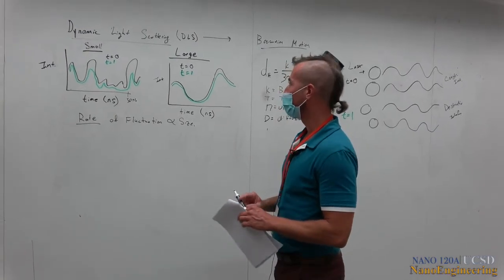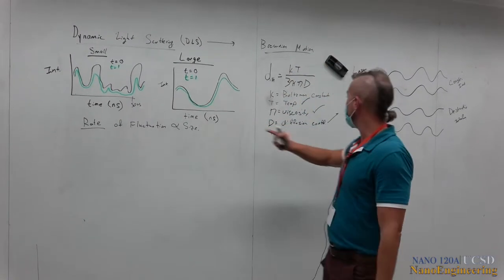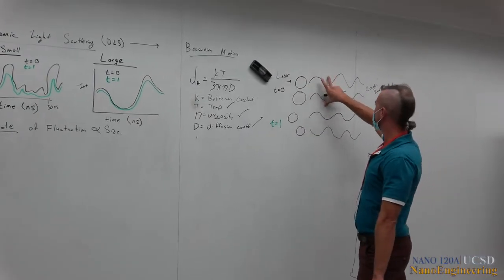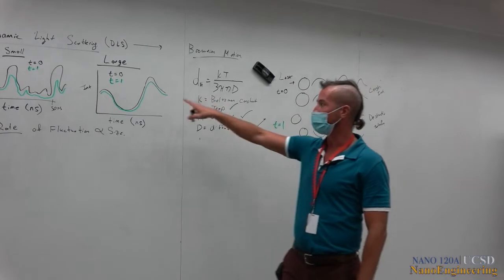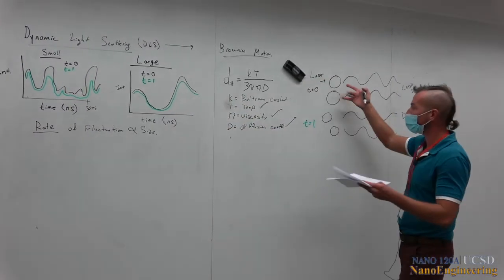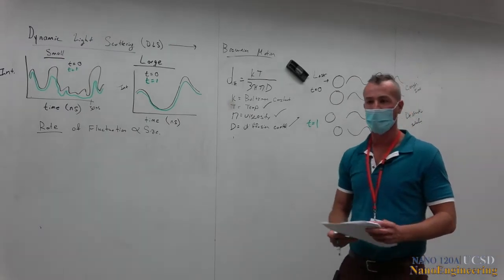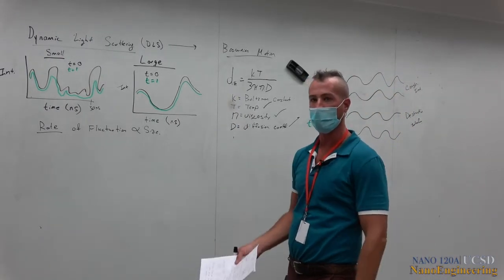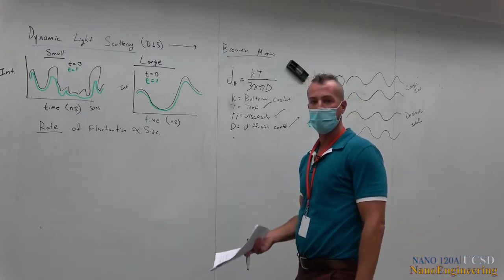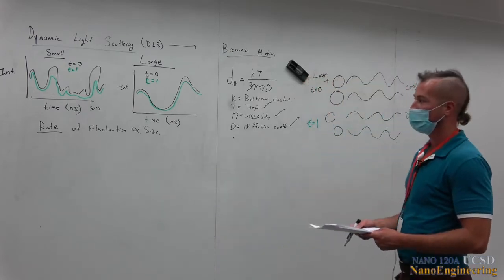Okay? Unless your particles are really big and they still basically look like this anyway. And then the combination looks basically the same. Okay? Obviously, in reality, you have way more than two particles, right? You have billions of particles. But they all are collectively, constructively, and destructively interfering. Okay?